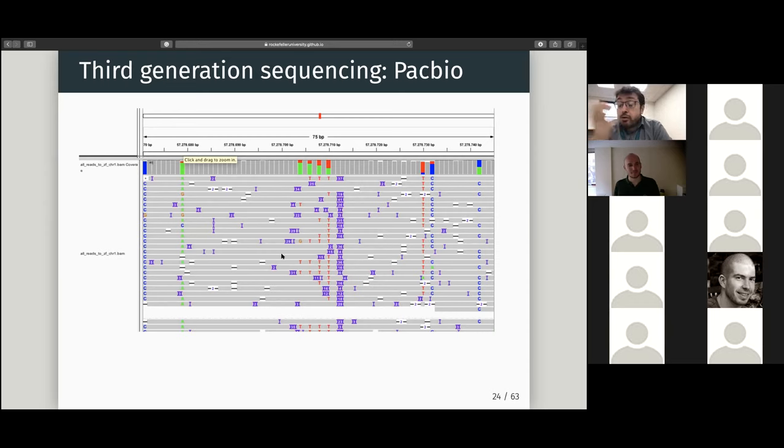If you take Illumina errors, the 1% error in Illumina is more systematic, and you will not be able to correct that. But with PacBio, you kind of approach this. You can take a bunch of these PacBio sequences, very low quality, assemble them, and with the amount of overlapping data, you'll be able to reach a decent quality. In the past, people have been adding Illumina on top of that to polish these sequences even more.